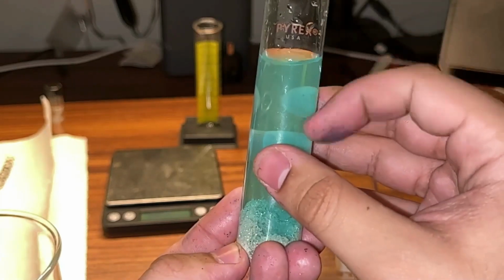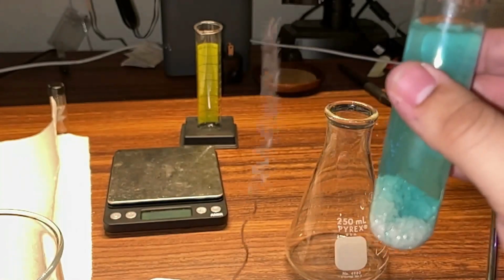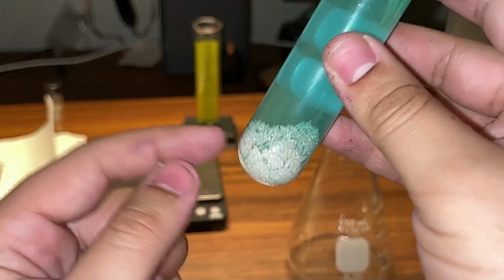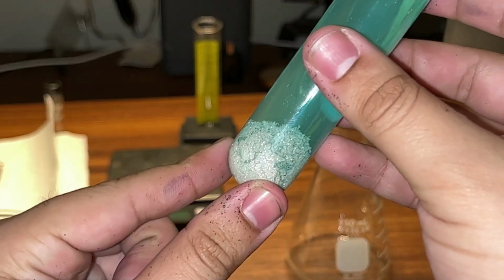So that's why this blue color's there, because there was no copper in the solution before. Before, all the copper was on the wire, right? But then I was dissolving the copper wire into copper ions, and the silver ions became solid, right? So a real single replacement reaction.